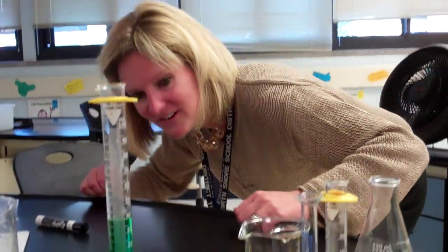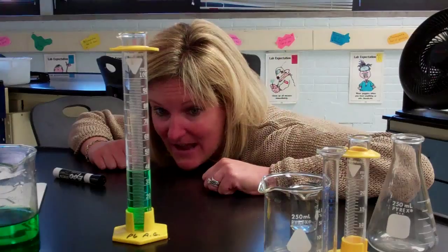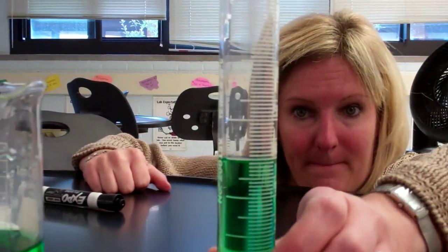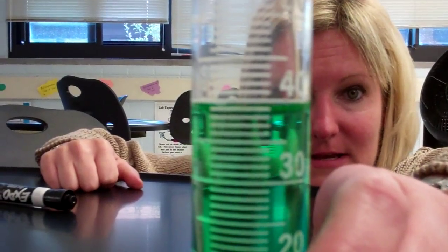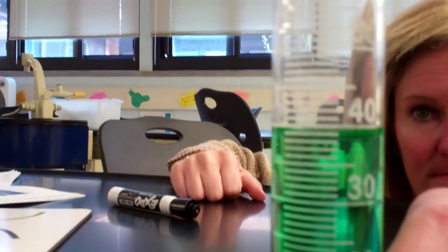Oh, I totally forgot. So what you need to do is go down to eye level, crouching down and making sure you get the appropriate measurement. So that would be approximately 40 milliliters of the green liquid. It's just water and food coloring.